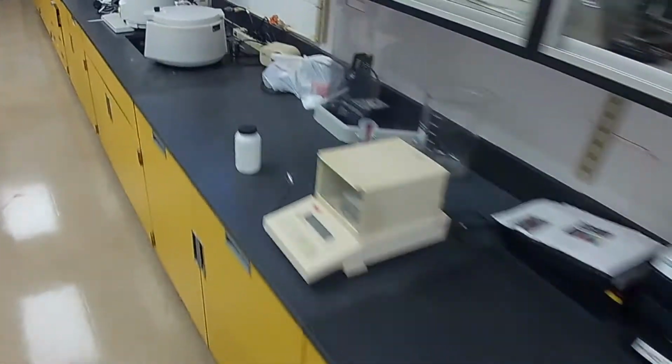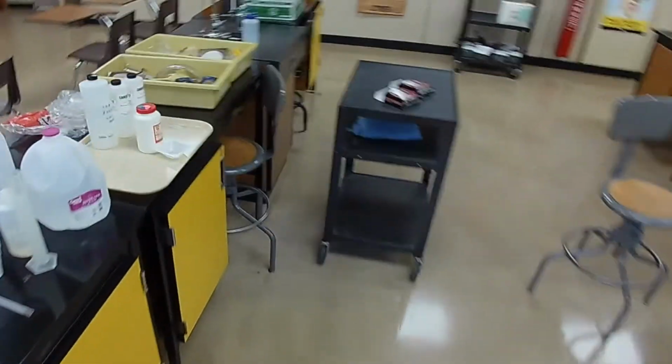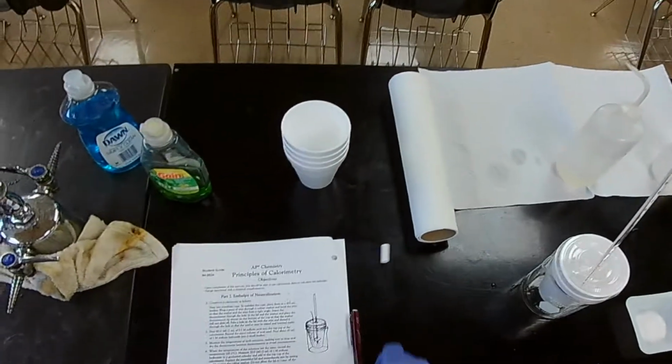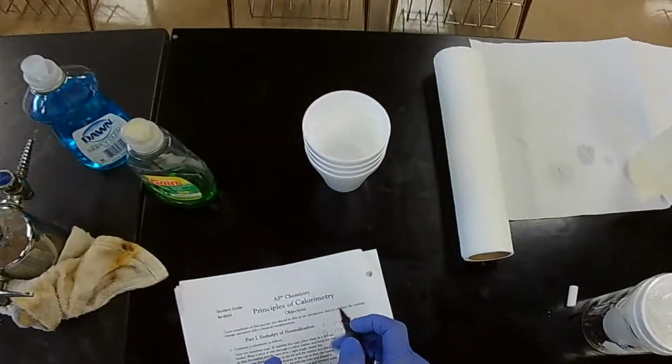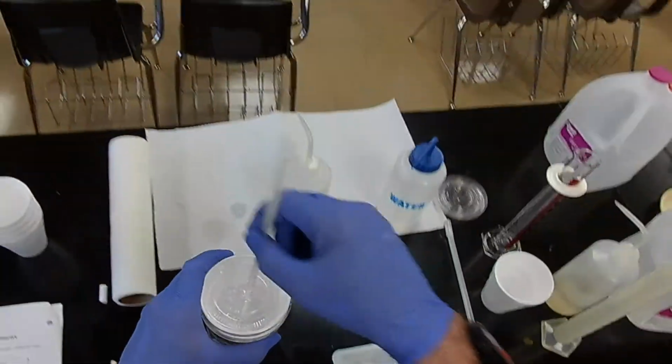Now we need temperatures. What's the initial temperature? Let's take our sodium carbonate and the bottle here and get an initial temperature. All right, we're going to use these. Initial temperature. Let's see what it is.